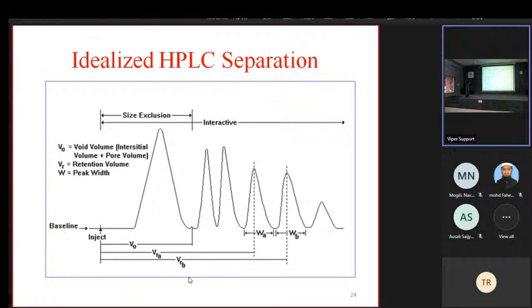Carryover effect, for example, and calibration. How is the carryover effect affecting the procedure?